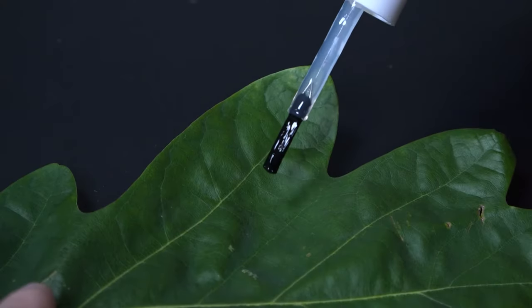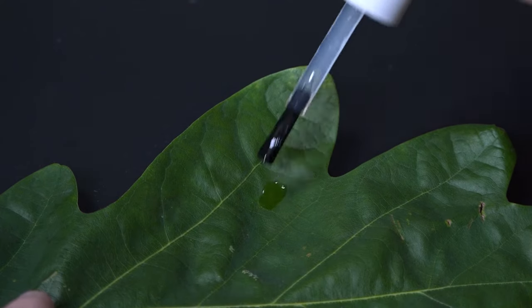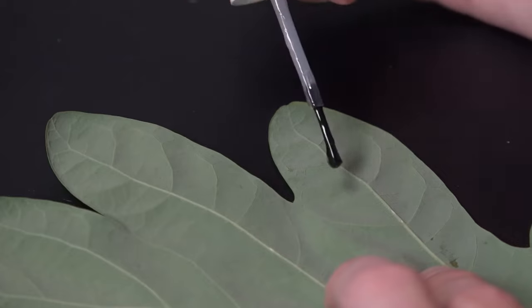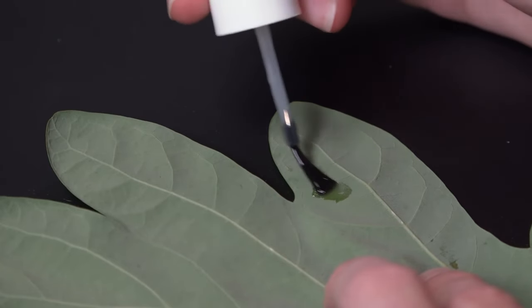First, I'll paint a small patch of nail polish on the leaf, avoiding major veins since they can mess up the peeling process. For funsies, let's compare the top and bottom surfaces of the leaf.